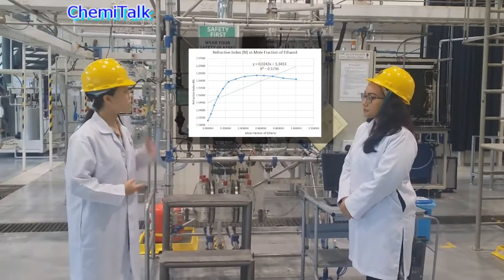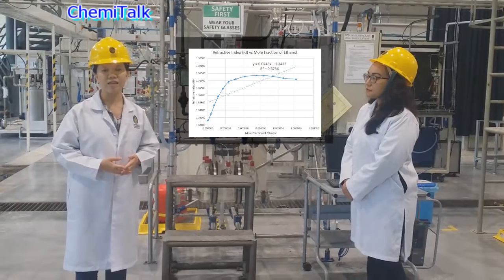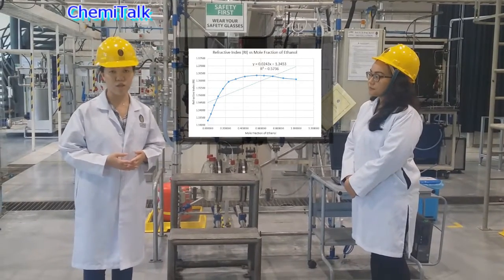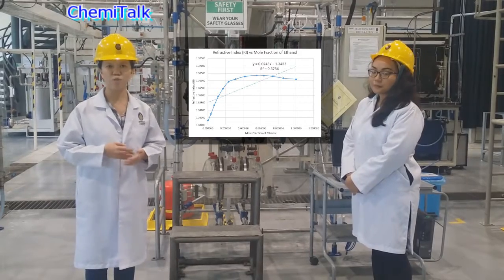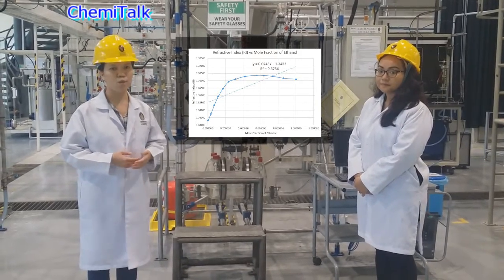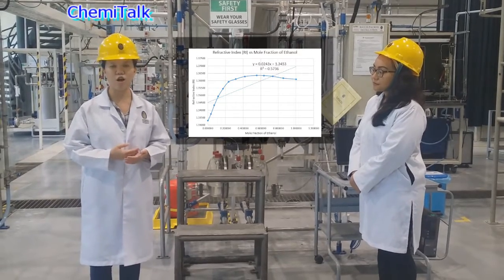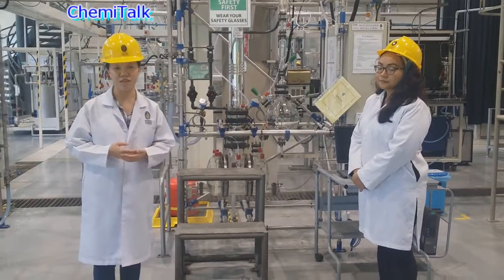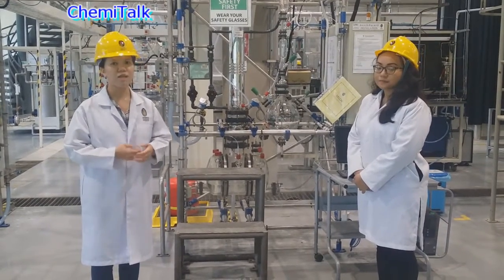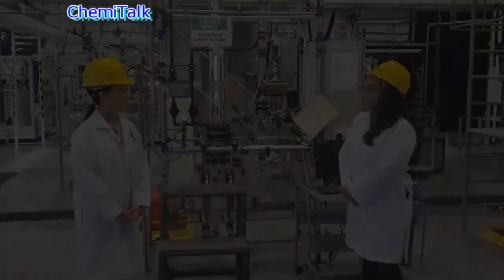Another way of using this calibration curve is to draw a best fit line, and a linear equation is obtained, which is y = 0.0243x + 1.3453, where y is the refractive index and x is the mole fraction of ethanol. Then, by substituting the value of refractive index into this equation, the mole fraction of the ethanol can be calculated. Thank you, Ms. Lee.